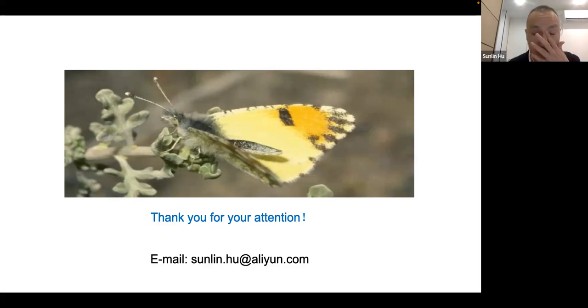And there's another reason, that is the sensitivity of this test is very, very low. Just as I mentioned, only one-third positive test rate can be achieved with conventional methods. And it is laborious. All of these reasons restricted this test from being used in many countries.